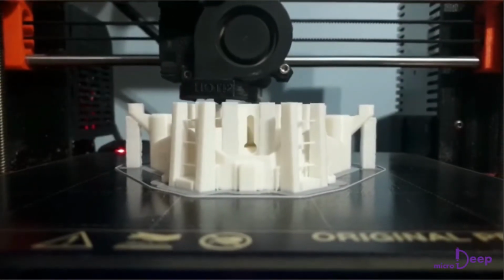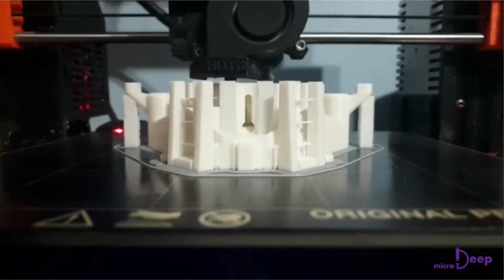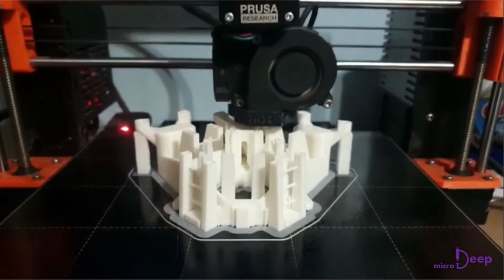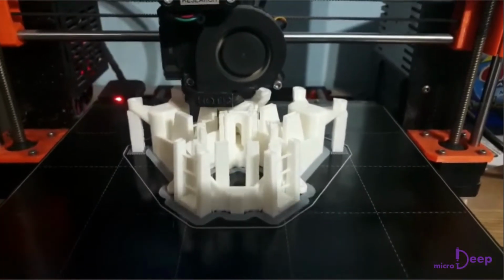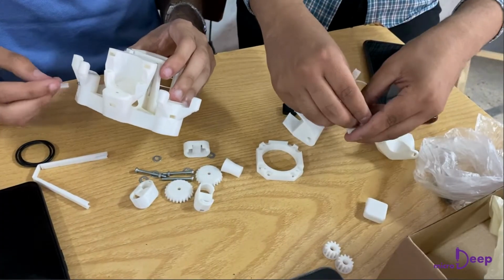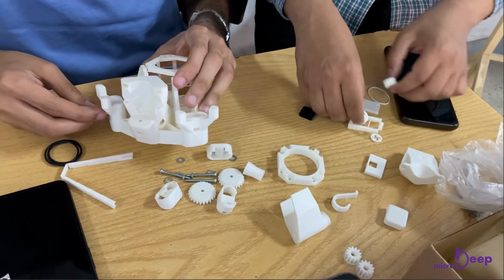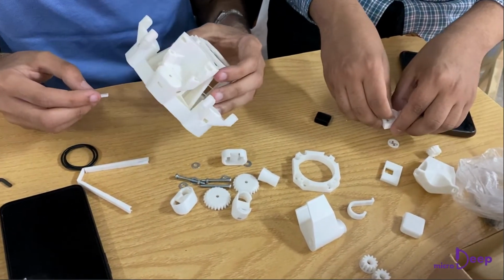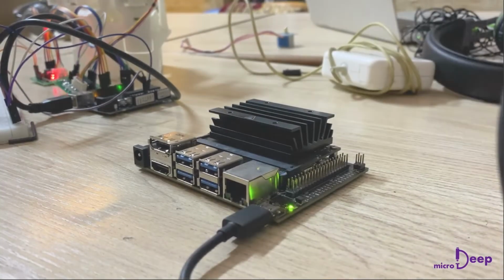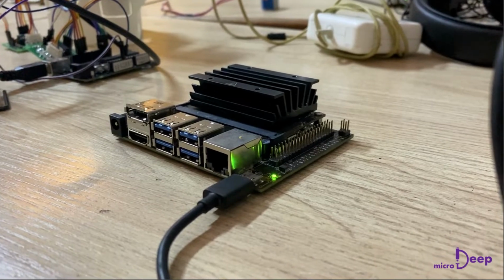Using the design of the OpenFlexure open source microscope design, we used 3D printed components to create the microscope body and stage and to contain the optics module. We have chosen to use the OpenFlexure design because it is open source, cost-efficient, and portable. The NVIDIA Jetson Nano board was positioned on the manufactured microscope.